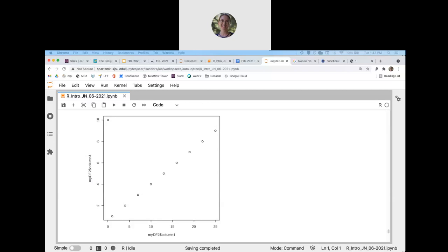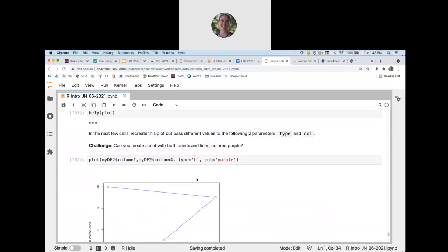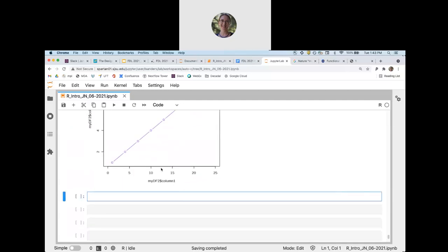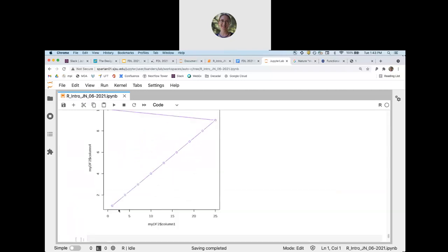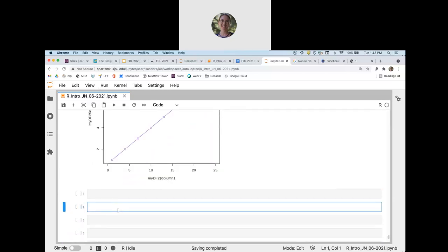Okay, first of all, there is code for exporting your plot, which I will find. I don't know it off the top of my head. There is a way to rename a column. Let me see. Let's finish with the graphs and then go back to renaming columns. You didn't miss it. I didn't talk about it. Eowyn, when you say especially for the graphs, what do you mean exactly?